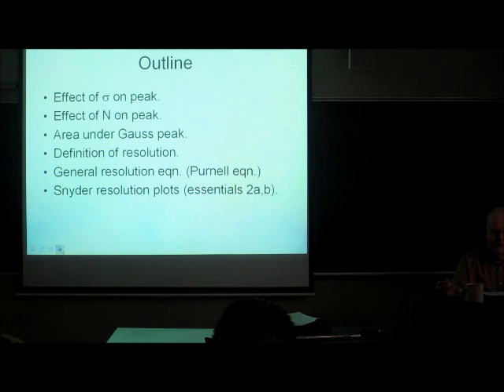Then we'll start examining what happens to a pair of peaks as the resolution changes, as it gets worse and worse and worse, or as it gets better and better and better. And we'll look at pairs of peaks like 1-to-1 peaks, equal height peaks, then 2-to-1 peaks, and then more and more discrepancy in the peak heights, and see what happens. See how much resolution you need to get a decent separation. So that's most of what we're going to talk about for the next couple of days.